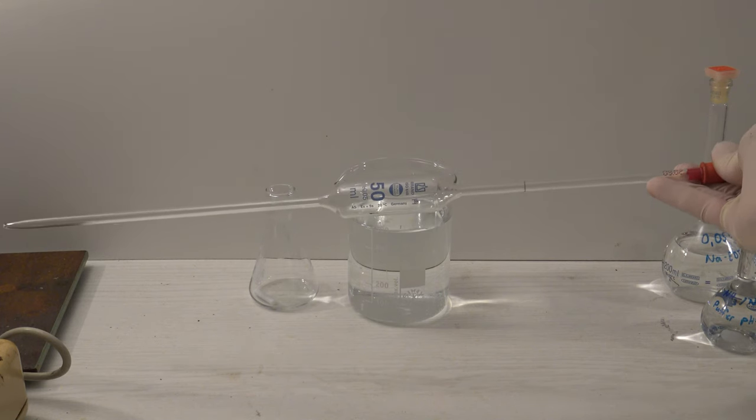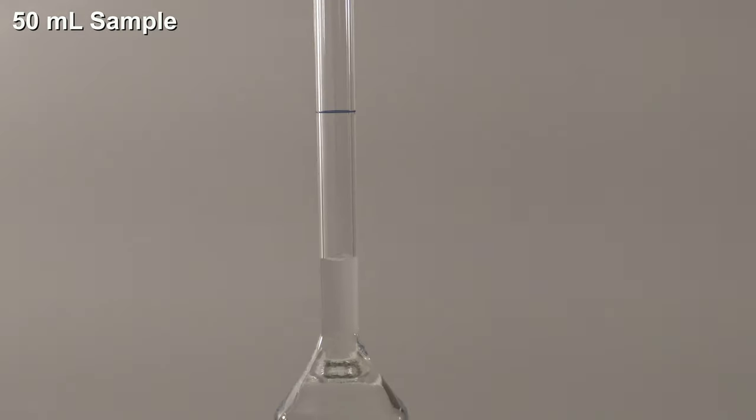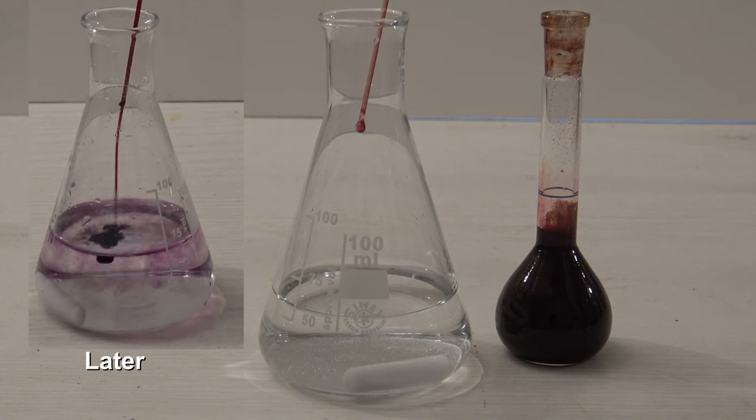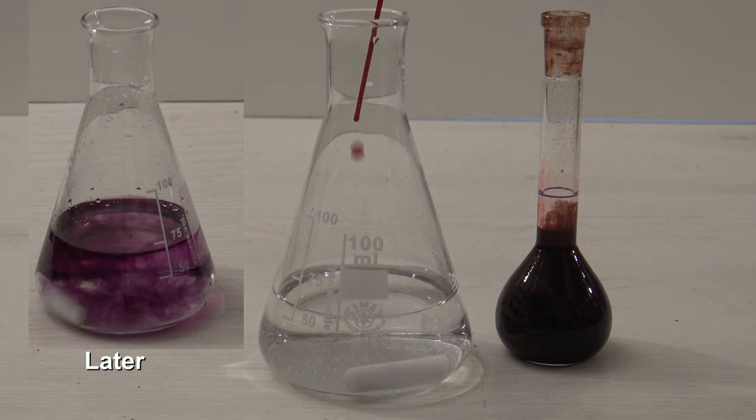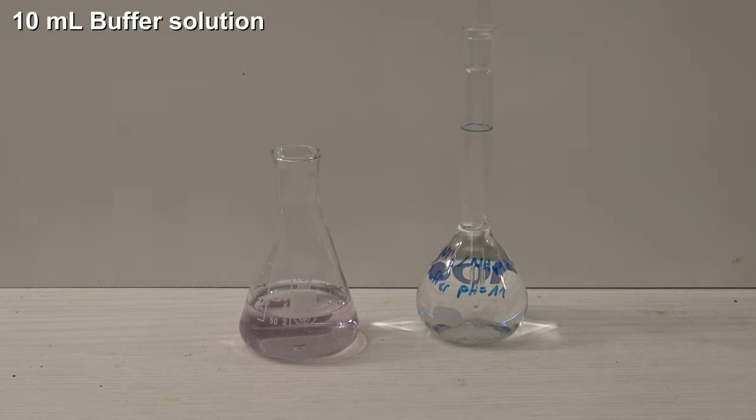Next, a sample of 50 ml is taken from the water that should be measured. Then the indicator is added. It was found out that the amount was way too low, so more should be added. After adding 10 ml of the buffer solution, the sample is ready for the titration.